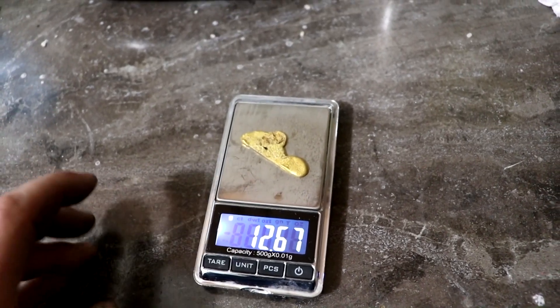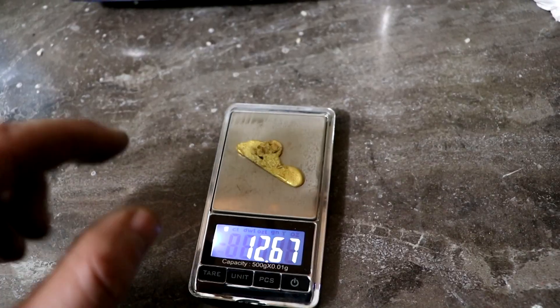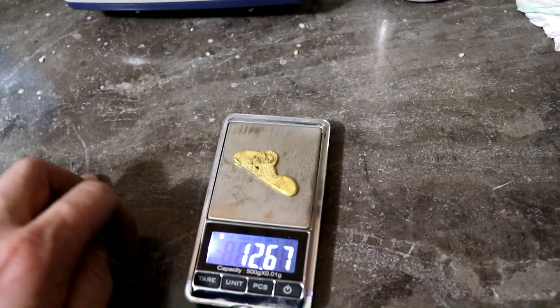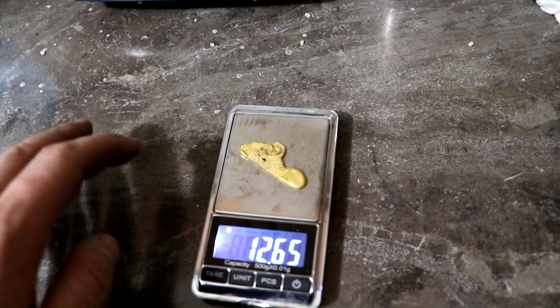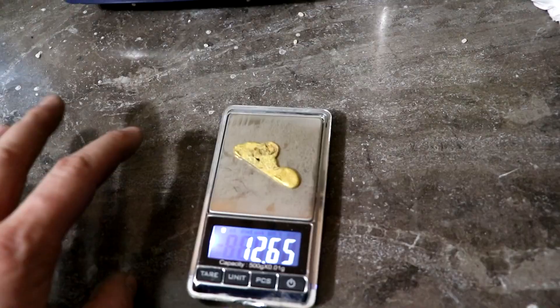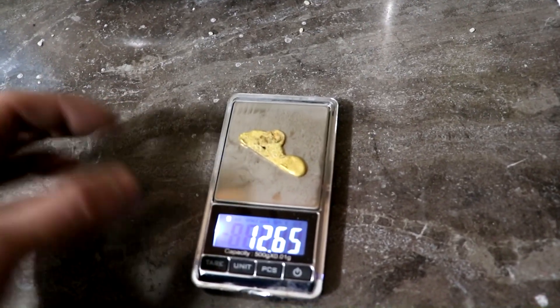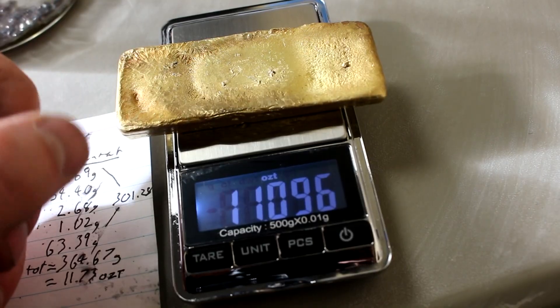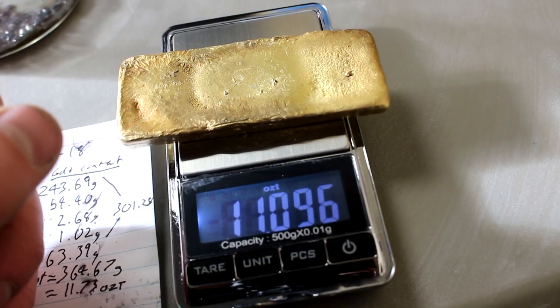So that brings my total to 357 grams of gold recovered in this video. That still is about seven grams less than I was expecting, but that is a discrepancy that is probably about what you'd expect — the carat value of the jewelry is not 100% accurate and there were also a few gemstones. Given the current price of gold, that's like $15,000 worth. If you're curious how much I actually spent on the jewelry and how much profit I made, I've got a spreadsheet set up over on my Patreon. I'd like to refine it once again before I'd guarantee any sort of purity — it's probably at least 99% though.